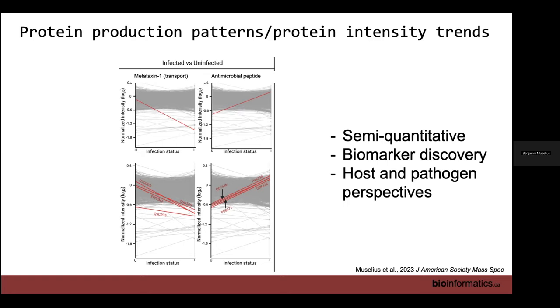I'm asking this because I know some people use this kind of data, for example RNA-seq in the paper. I see some people use gene set enrichment analysis to see how these genes will be enriched in some part. I wanted to see if for proteins there are special methods or categories which you use.